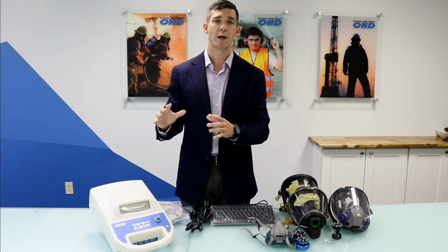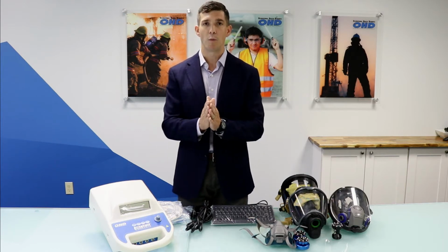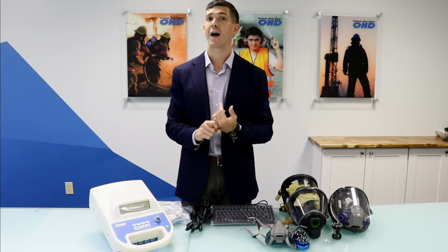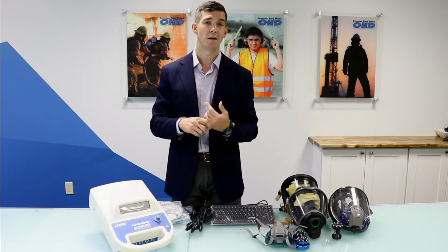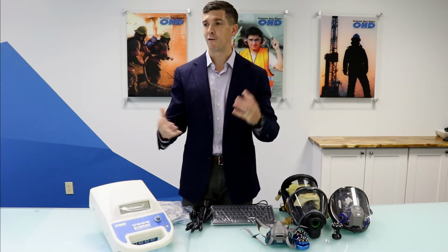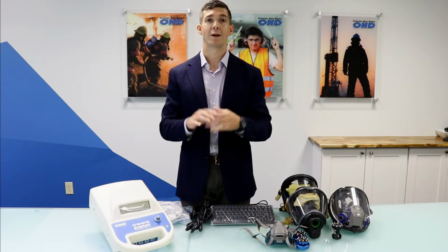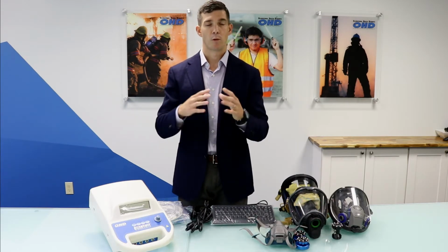So later on in our training resource, you'll see us go through a fit test, but it's important to understand that we're pulling that pressure and we're measuring leak into the respirator and then giving a fit factor. Our fit factors will be given in cc's per minute of leak rate. That can be converted into liters per minute, whatever you want to look at. But at the end of the day, the key is to understand the fit factor is derived based on a guidance that you're using. So ISO or OSHA or so on and so forth.